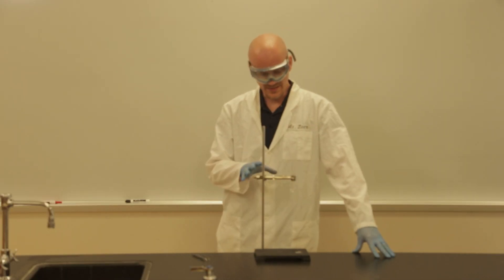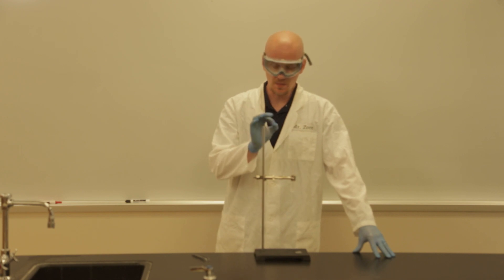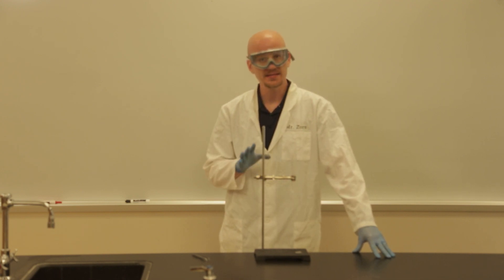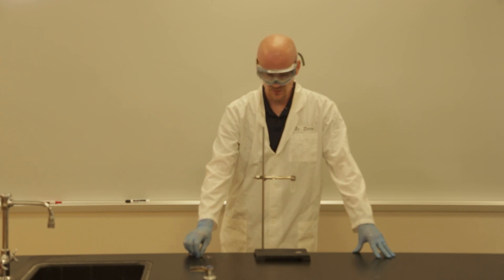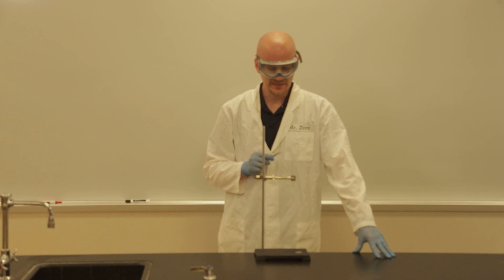All right, the next thing is we're going to take each sample and we are going to put a small piece in this test tube of hydrochloric acid and see if we get a reaction. So we carefully use our tweezers, grab a piece, drop it in there and give it a couple minutes to see if we have a reaction. Reactions would be bubbles, smells, or anything like that.